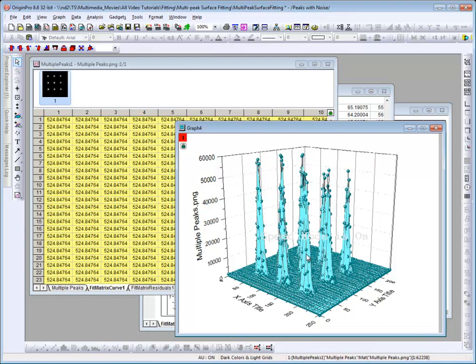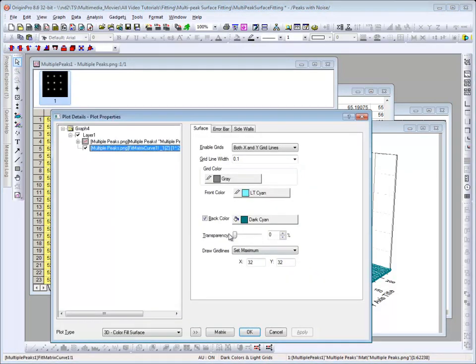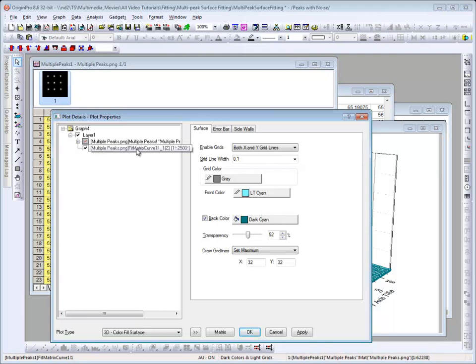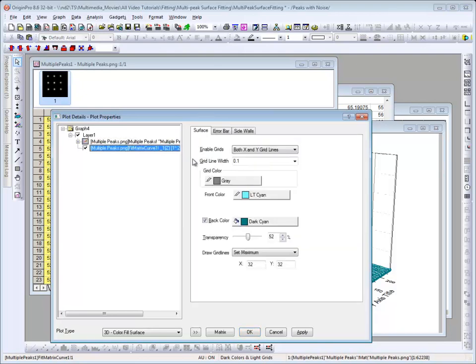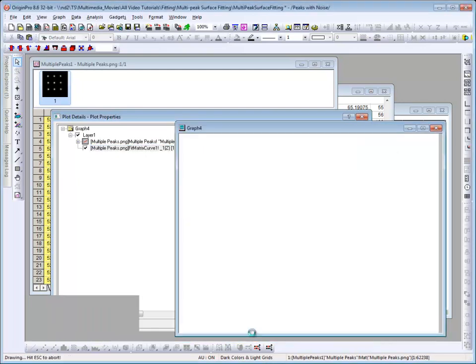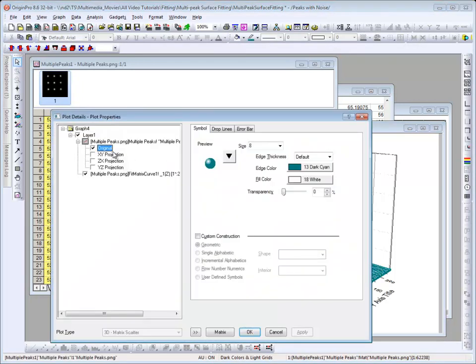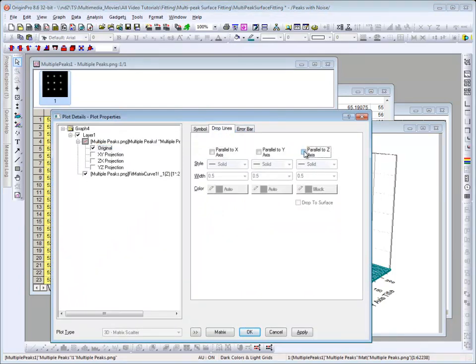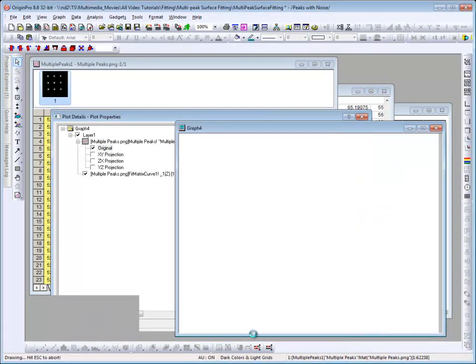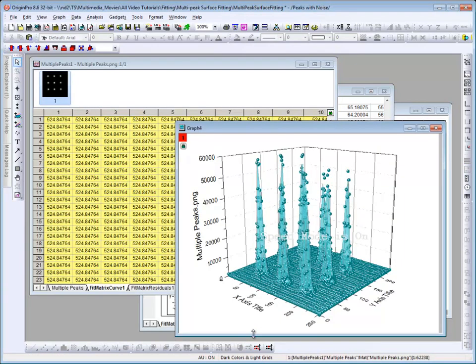One more thing we can do for clarity is to apply transparency to the surface. Another slight modification would be to turn off the drop lines that appear for the scatter data. And now we have a surface displayed with the corresponding data that was used to generate the fit.